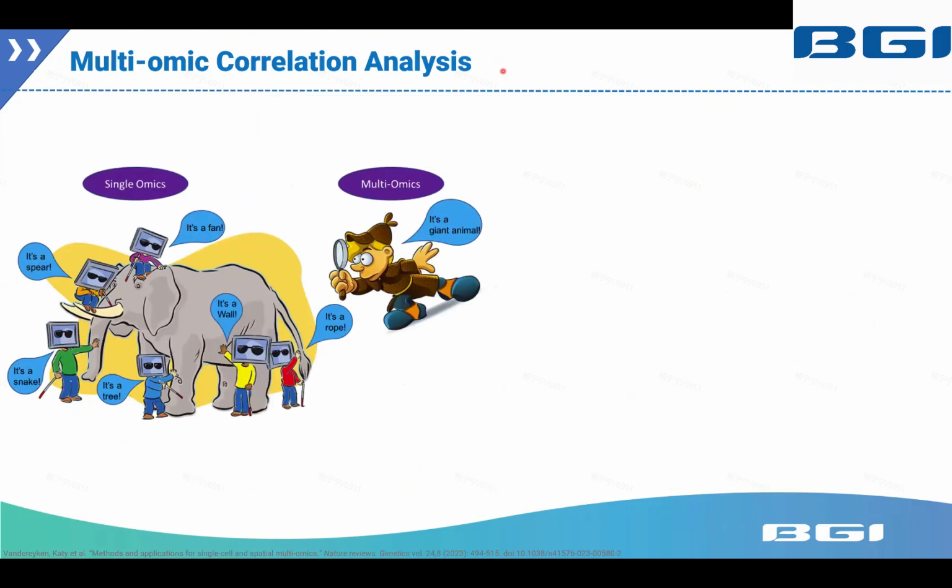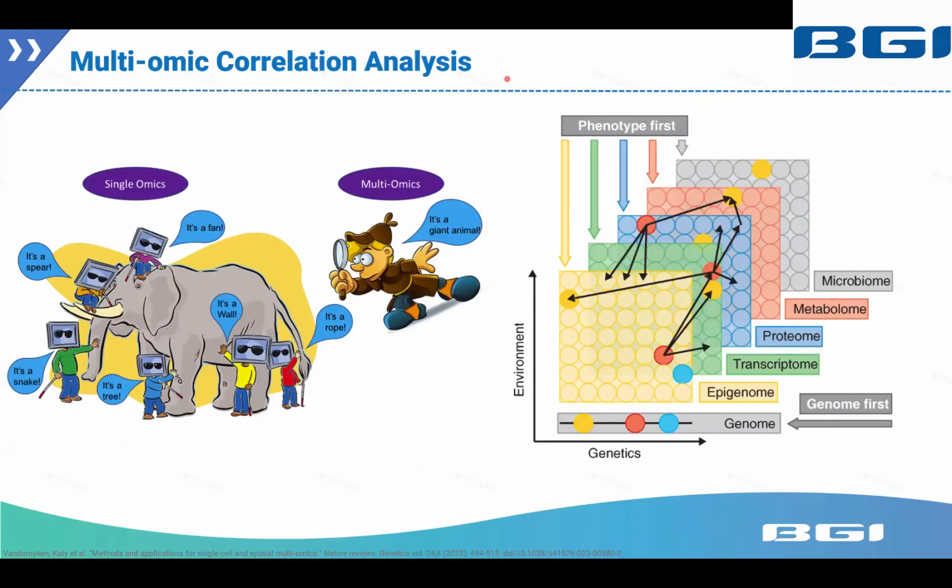Okay. If you visit the Dr. Tom system, I think you will find that besides the demo data for single proteomics and single metabolomics, there will also be data for correlation analysis. This is because single omics can only provide information from one part of our research subject, while multi-omics can help us understand the overall situation comprehensively.